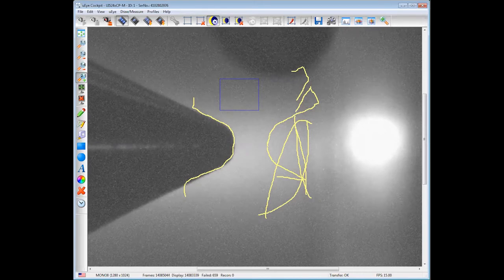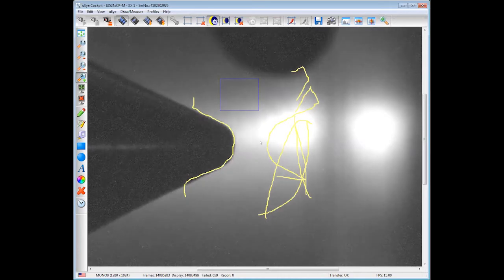It is, because you should understand, for having a good signal, you should fulfill some condition. The condition is that you should send the beam just in the one point which is in front of this small aperture, which has a size, as I told you, of 300 microns. As soon as your sample is a bit farther or a bit closer, the beam comes with some angle, so it will irradiate not exactly the position in front of the hole, and then you have a very low signal. We do this fine alignment after we insert the sample.